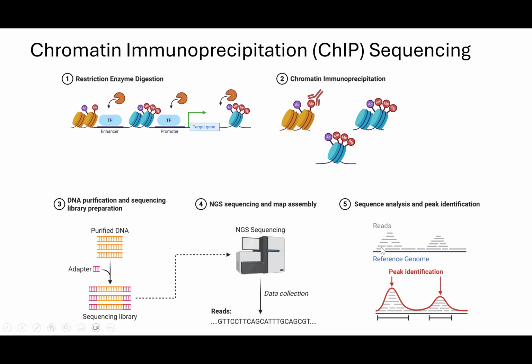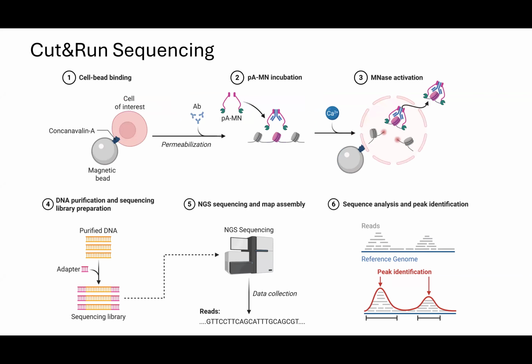You're just going to more simply align it to the genome itself without having to worry about where the exons are or splicing or any of the things we talked about with the RNA. Something we'll talk about a bit later is that once you have all of these sequencing reads aligned to the genome, you might notice certain locations where there are a lot more than others, and you want to identify where those are. There are computational ways to identify those.